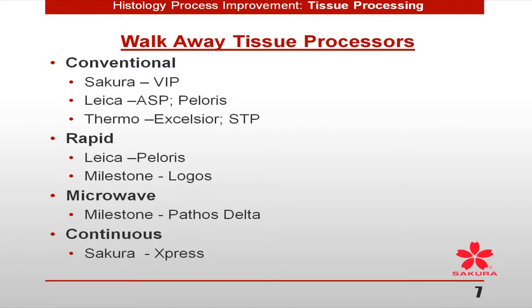And what I call a walk-away tissue processor, that's something that you can place those cassettes in. And we do have specialized cassettes nowadays. So you place the cassettes in a rack or holding receptacle. You're able to place anywhere from 1 to hundreds of cassettes. Press a button. You've preloaded all kinds of reagents onto that instrument. You come back and you've been infiltrated into paraffin, so that you can move on to your next step.